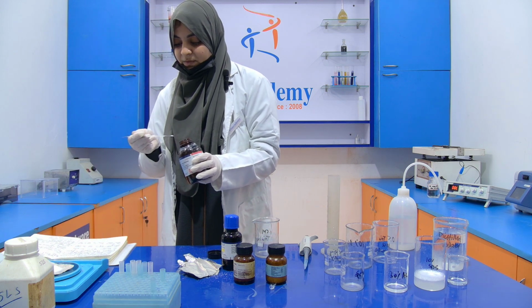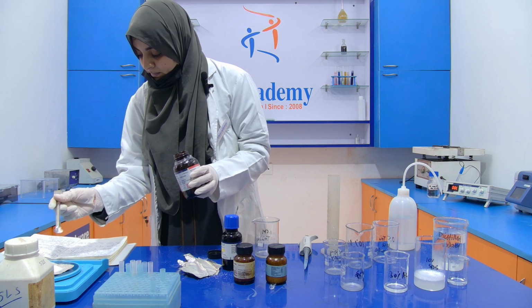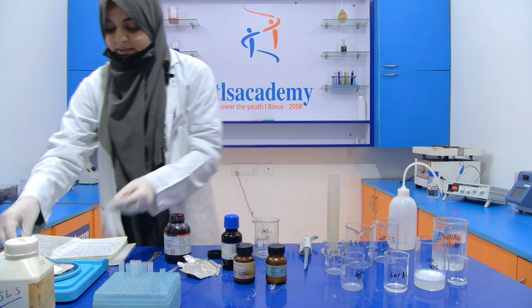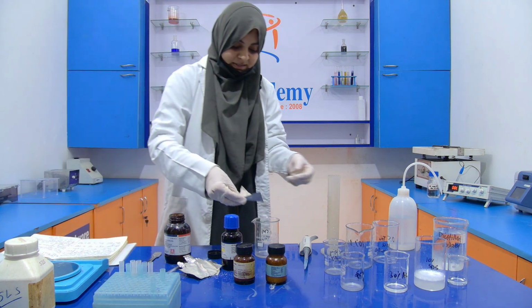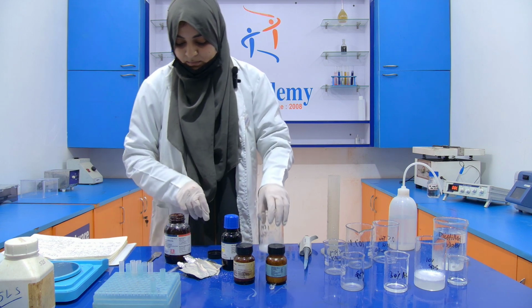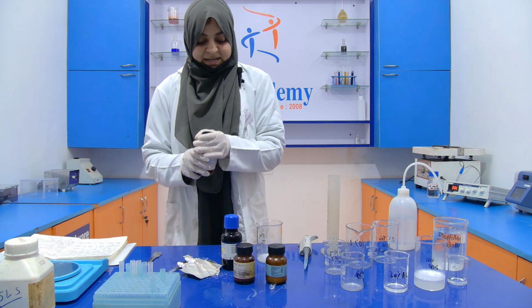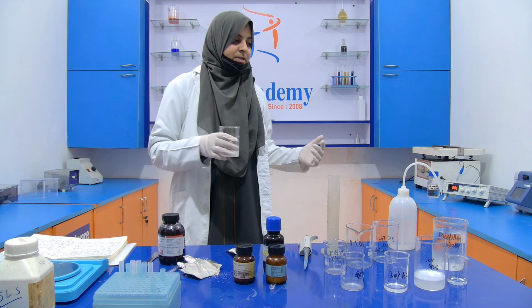See, the amount of this Tris HCl and the pH of the Tris HCl is very important. Now it is 2.36. Now dissolve this 2.36 into 10 ml of distilled water. Now first maintain its pH with the help of the pH meter.